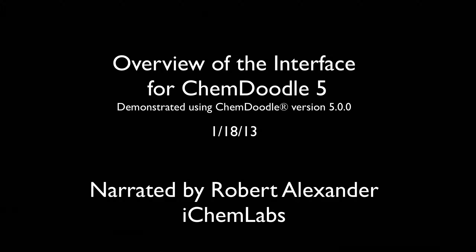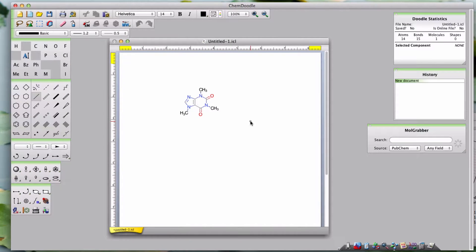Hi, I'm Robert Alexander from iChemLabs and this is the interface overview tutorial for ChemDoodle version 5.